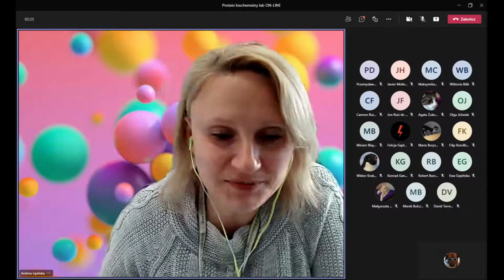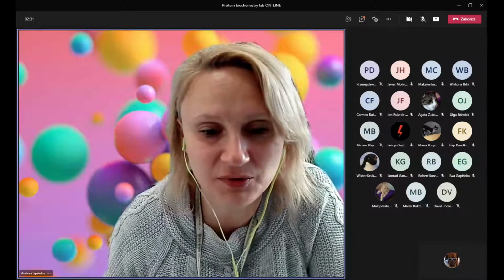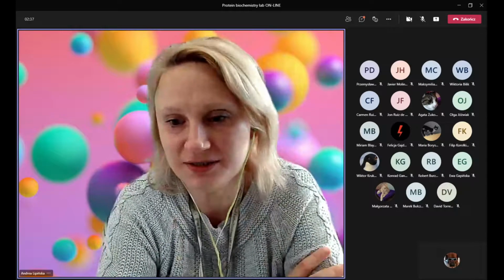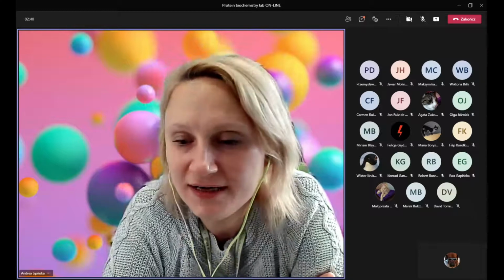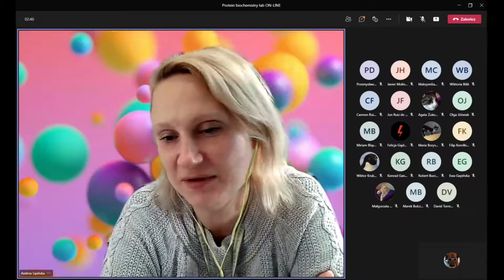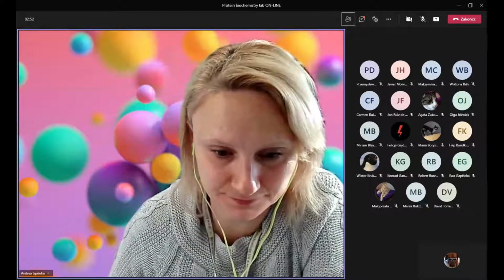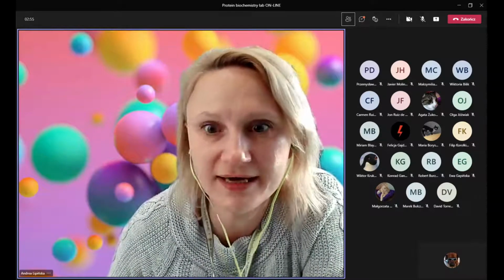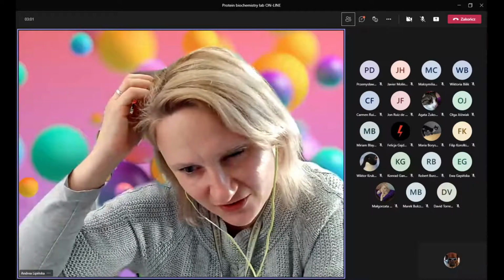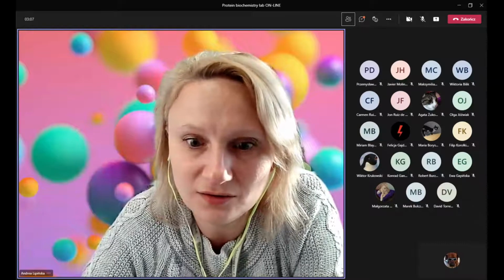Okay. Today's presentation is the last part of theoretical information and the background behind our laboratories. Maybe we can start from your labs. Was there anything that you did not understand fully, or you have questions, or you disagree with something during the procedures? The question is whether you've seen your result and you understand the result of Western blotting. Yes, we have seen it.